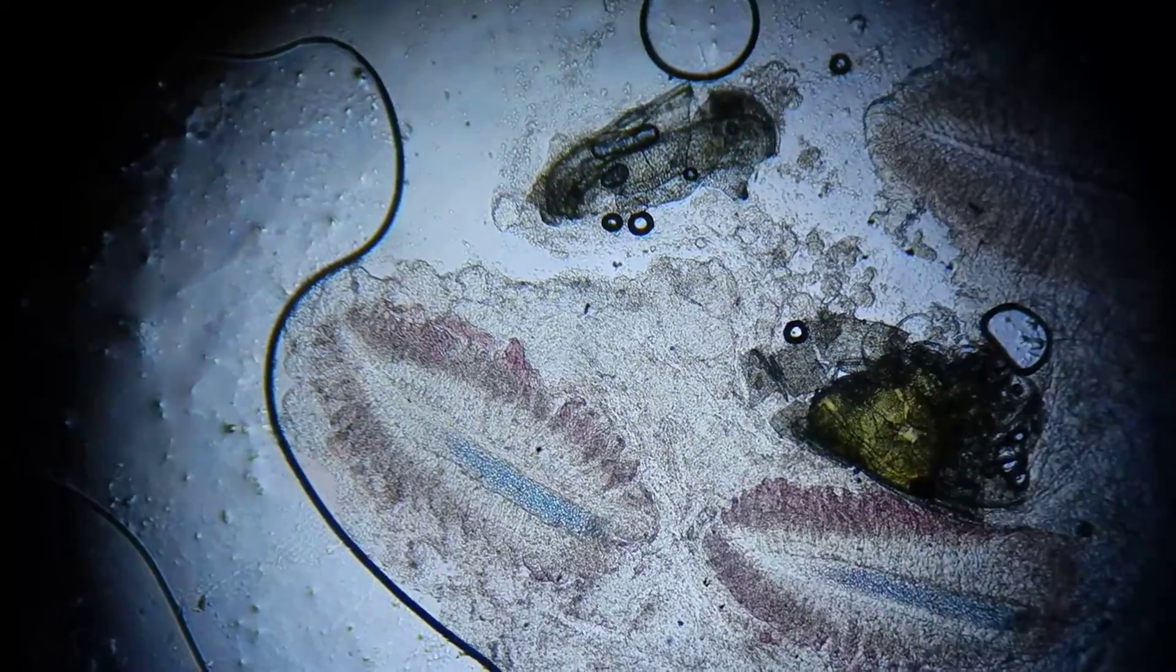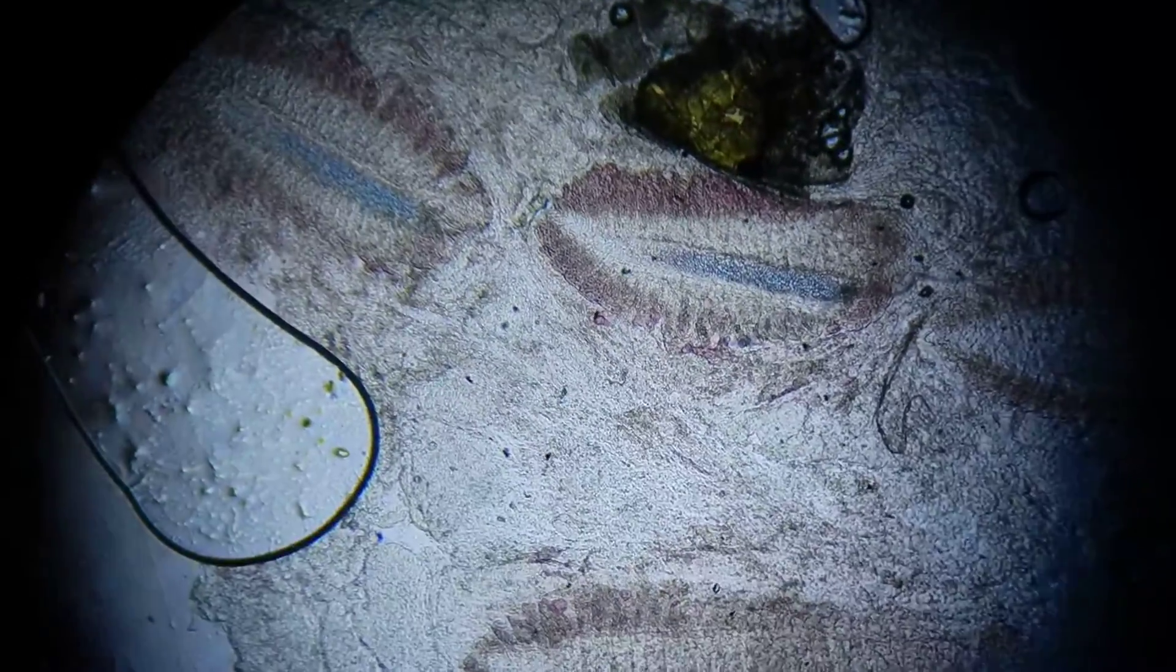So there you have it. Wet preparation examination of gill biopsies. Normal and abnormal.